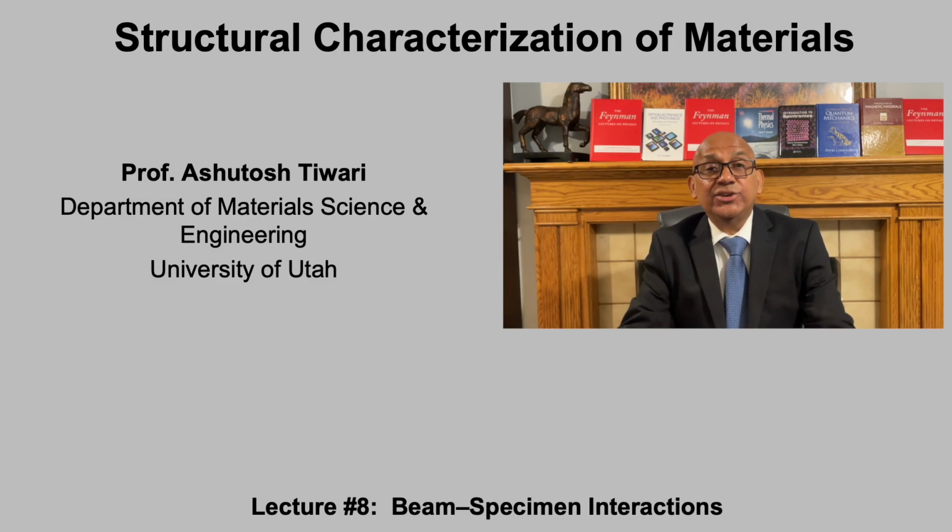In the last lecture, we saw that the resolution of a scanning electron microscope is not determined by electron optics alone. Instead, SEM resolution is governed by three interacting factors. The first is probe size, which is controlled by electron optics. The second is pixel size, which is set by the scanning and sampling.